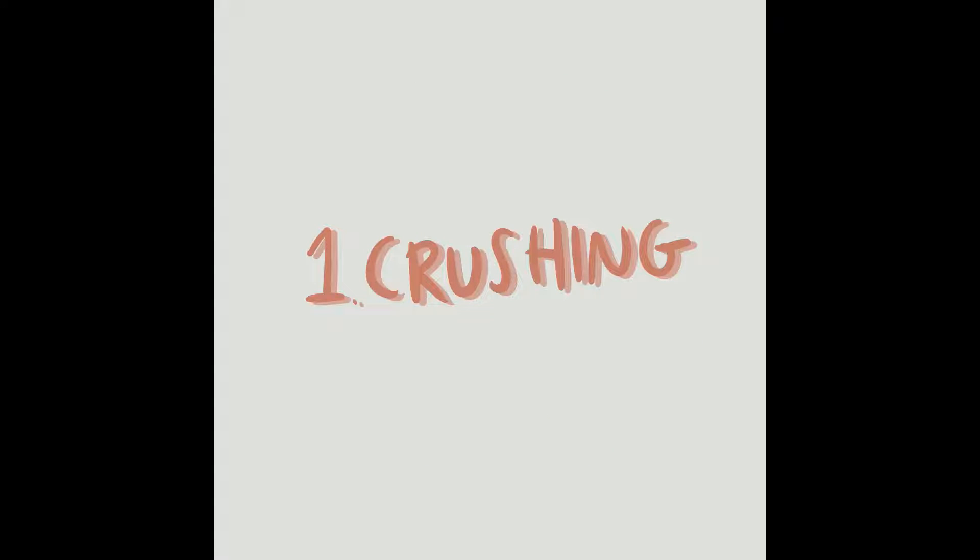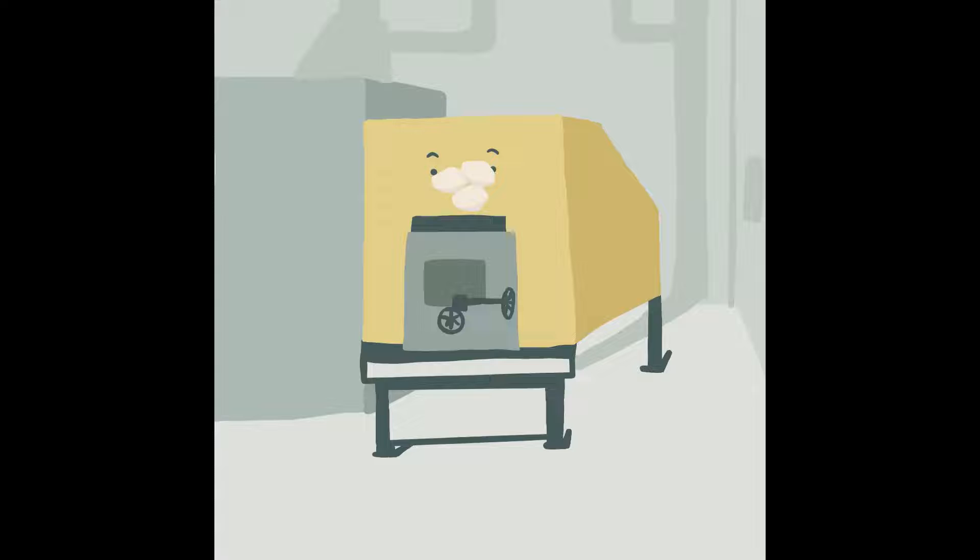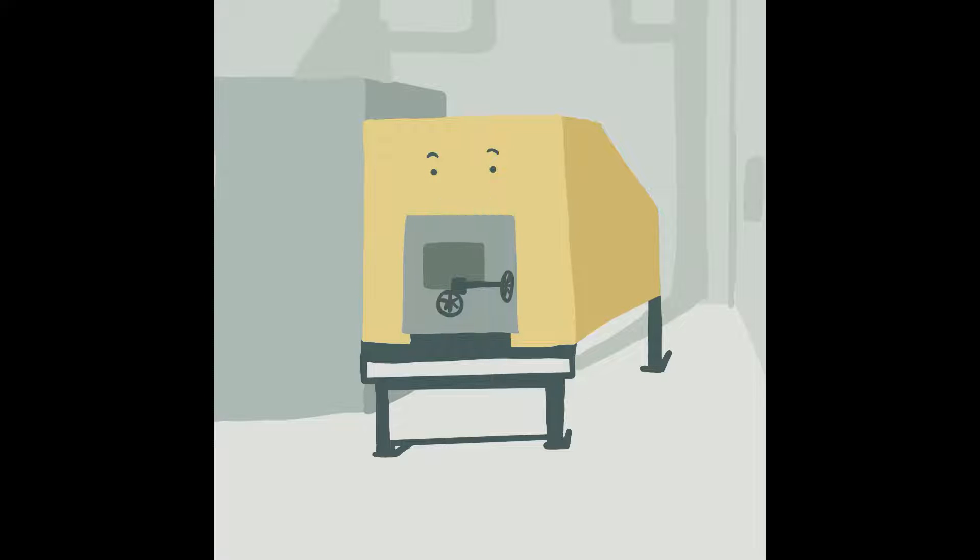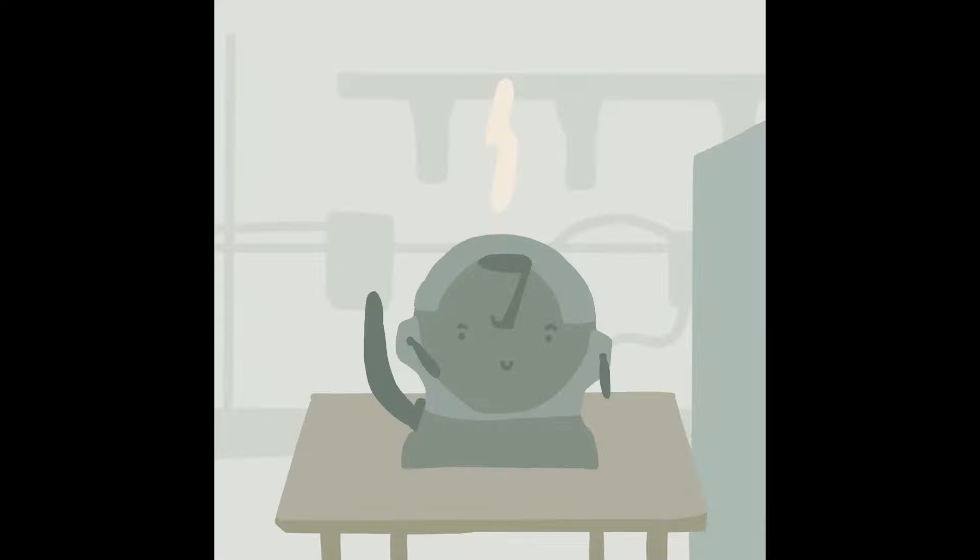The first step is crushing the sample using a hammer rock crusher. In the rock crusher, the rock chunks turn into rock fragments. And after the crusher, I put the sample in the mill to turn the rock into a fine powder.